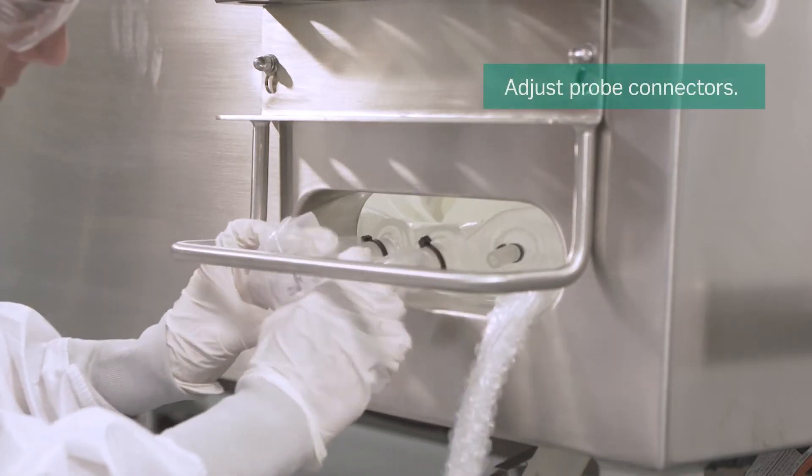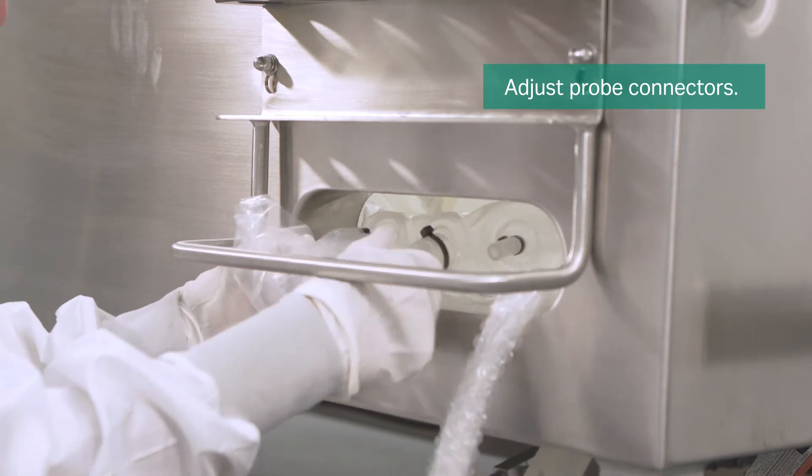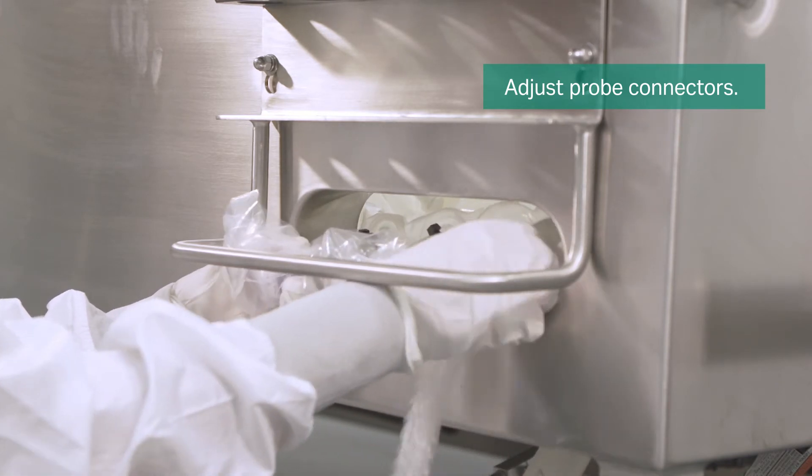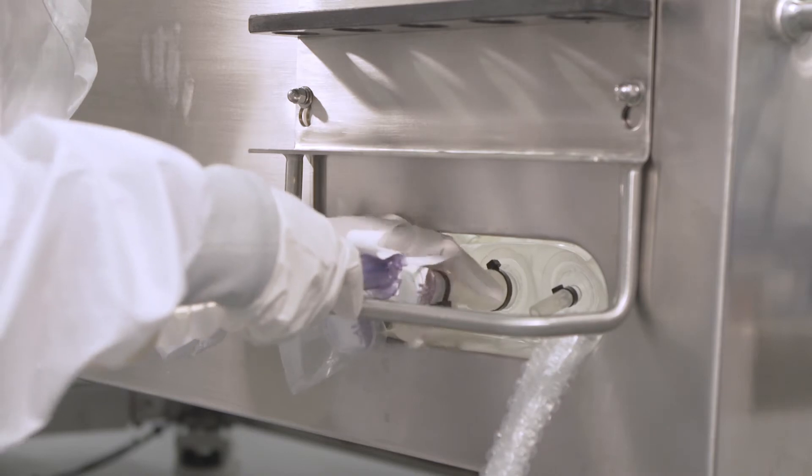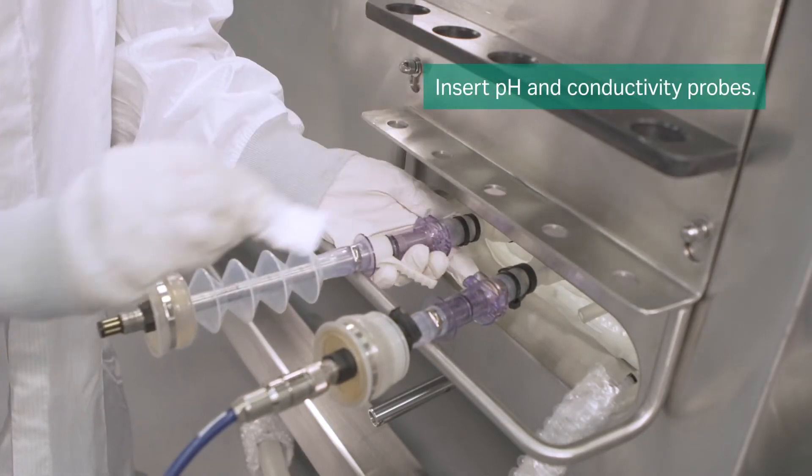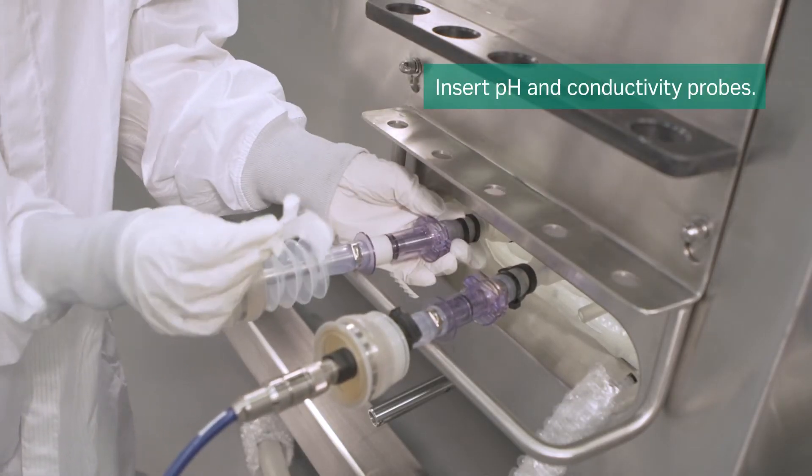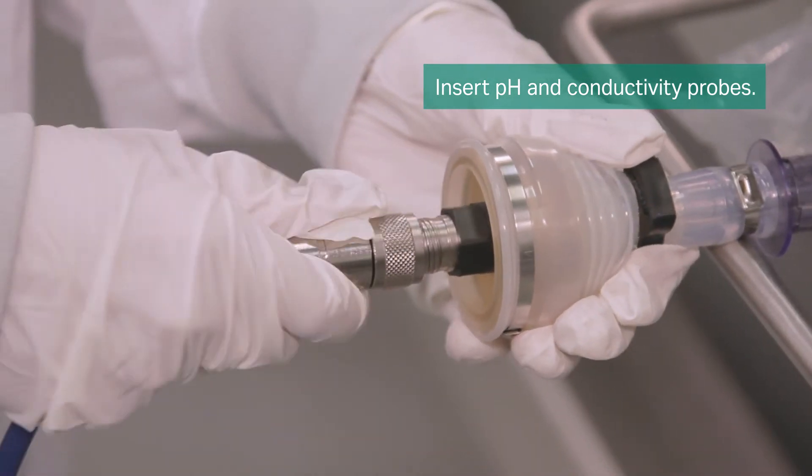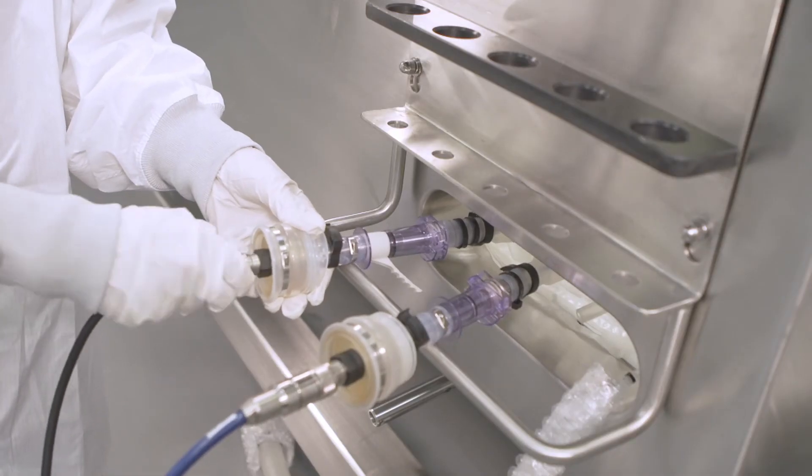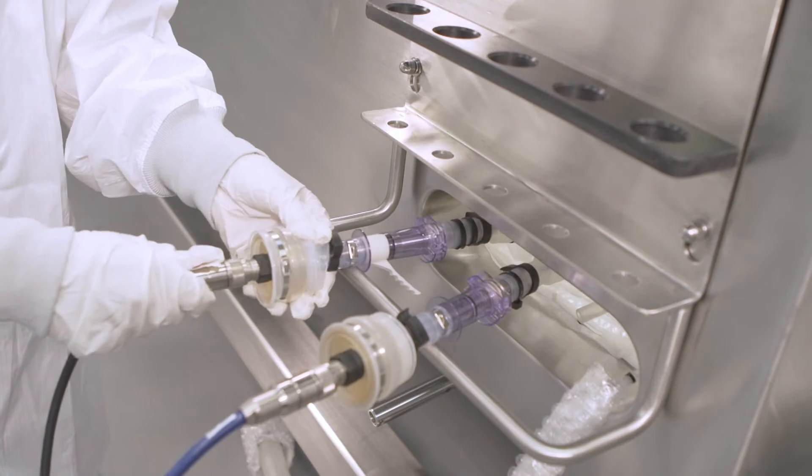If you are installing a plus bag assembly, adjust the probe connectors by gently pulling them through the probe window. Once the pH and conductivity probes are calibrated and autoclaved, insert the probes into the bag via the KPC ports.